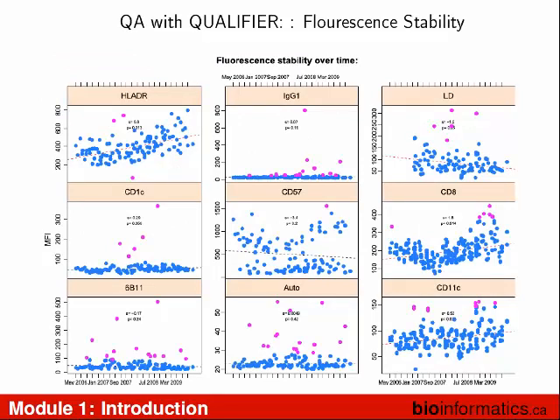Is there any expectation as to what kind of FCS files to turn to? Let's say I have lead data from a QA on cytometry. So the question is about expectations about files.